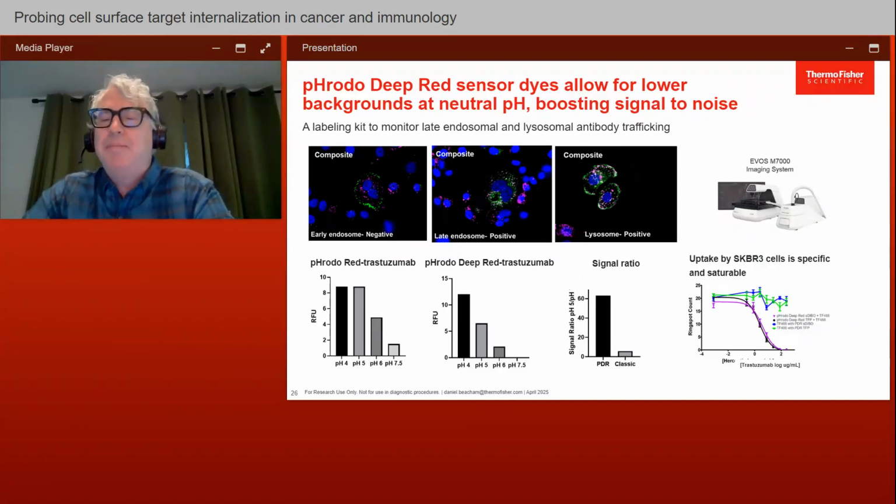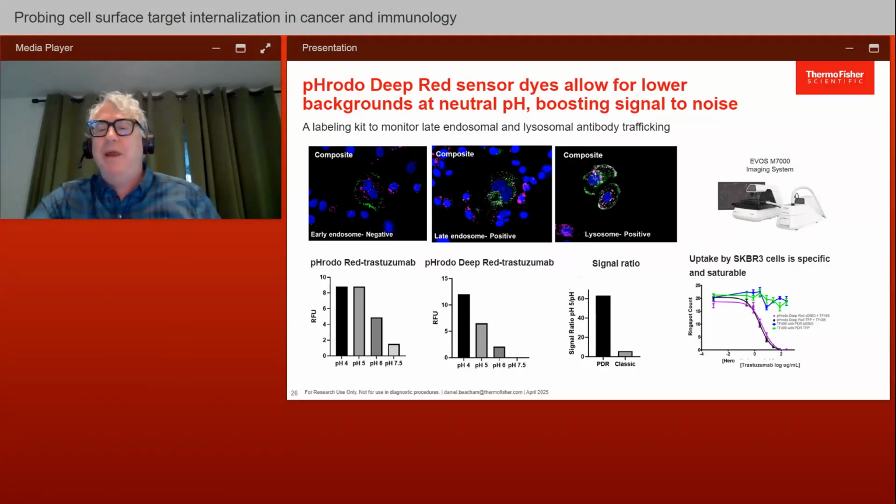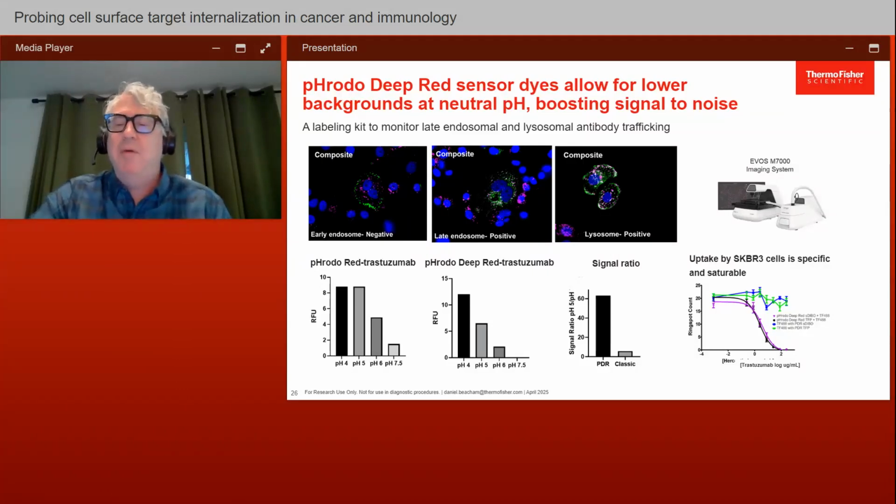In parallel, as I referred to a little bit earlier, I can visualize the transferrin receptor trafficking in and out of the recycling endosomal pathway, and I can show that my probe hasn't affected that at all.